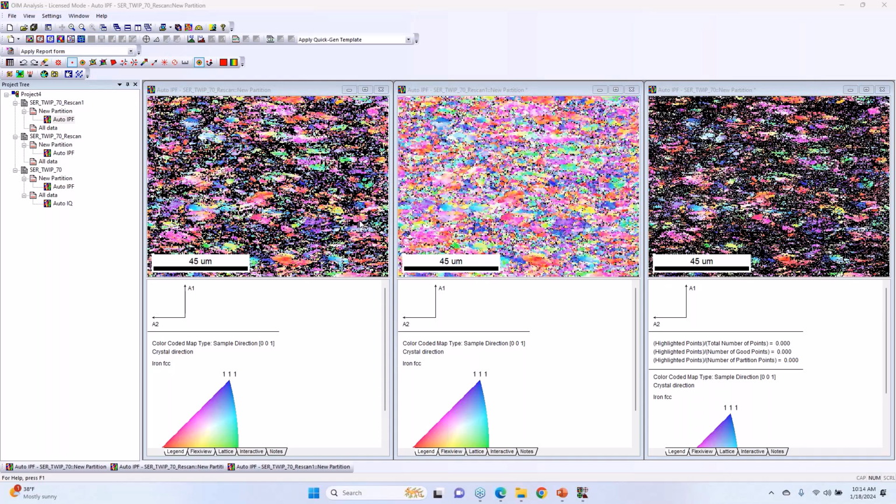Okay, so a few questions here. One: a version of OIM 8.1 did not come with NPar. So yeah, NPar is an optional module. It's sometimes bundled with certain detectors and not with others. But certainly OIM 9, as released, has both NPar and matrix available, so they are upgradable to that.